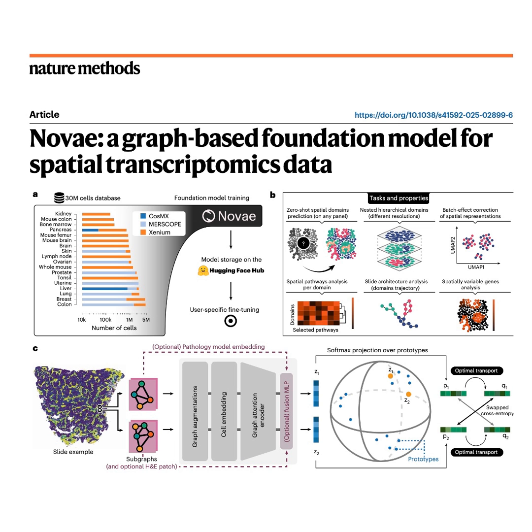So you get this mix: low-res with all the genes versus high-res with just a few genes. And that, plus the fact that researchers running 5 slides of breast cancer might use slightly different machines or tweaked panels, introduces that critical flaw we talked about, the batch effect. If my model finds a spatial domain, how do I know if it's a real biological niche or just a statistical echo of the fact that slide A was run on machine X and slide B was on machine Y? Exactly. And the traditional methods are just so limited because they rely on these painful external two-step processes.